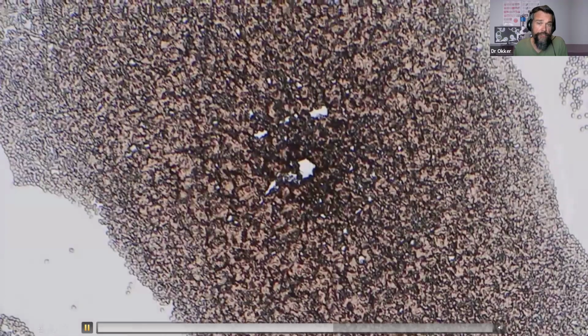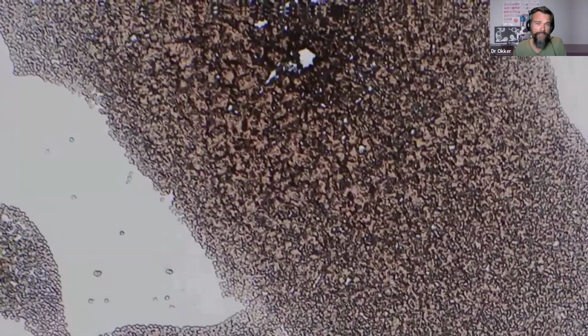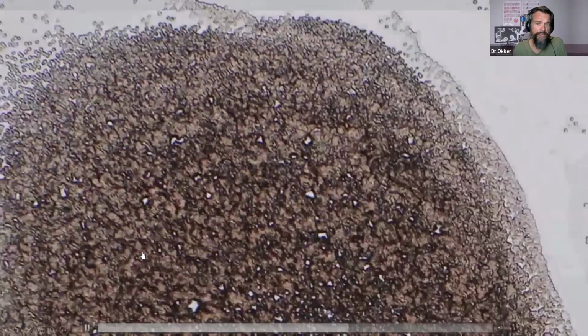Now we've switched to the dry blood sample here. The dry blood sample, we have 8 individual spots that we look at. Those all are allowed to dry on the slide, and we then look at the pattern or the patterns that emerge after the blood has dried on the slide. And there's various things that you can see here.